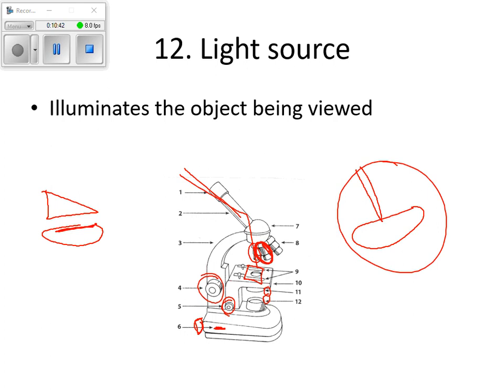We're not going to lose it, because when you zoom in, of course, you're zooming in, and if you're not zooming in exactly in the center, we're going to miss it. We're going to be over here, and then again, everything's backwards, so we're going to miss it, okay? And then you're going to be like, I can't see anything. Well, of course, because you're not even looking at it anymore. It's moved, okay? So keep that in mind. Always on low power. Make sure you adjust it so this is pointing right at the cell, the one that you want to look at first, okay? And then go from there. Okay, that's super important. Good?